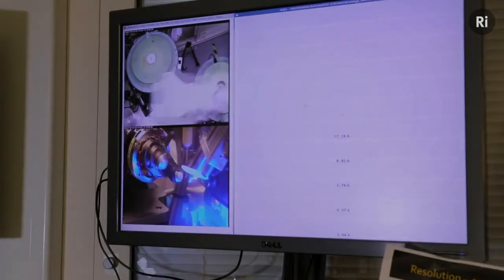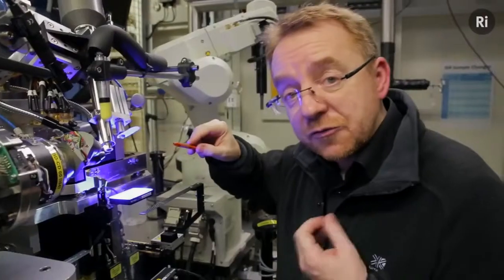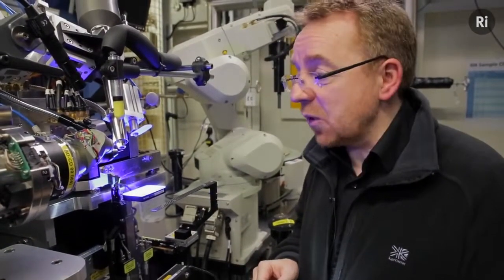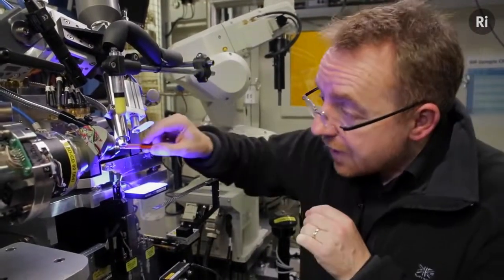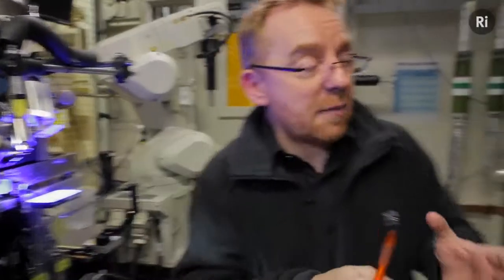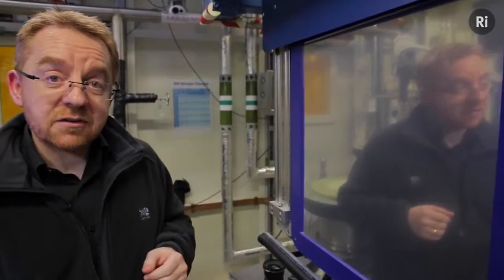During the experiment, the crystal, which is mounted on the end of this little pin, is cooled by ultra-cold nitrogen gas from this nozzle to help it withstand the punishing radiation. This allows us to take much longer exposures, which are needed when working with very small crystals. The X-rays from behind emerge here and are scattered by the crystal into many different angles. The diffracted rays are captured on this detector, which can record up to 25 images a second, much faster than the photographic plates that we used to use.